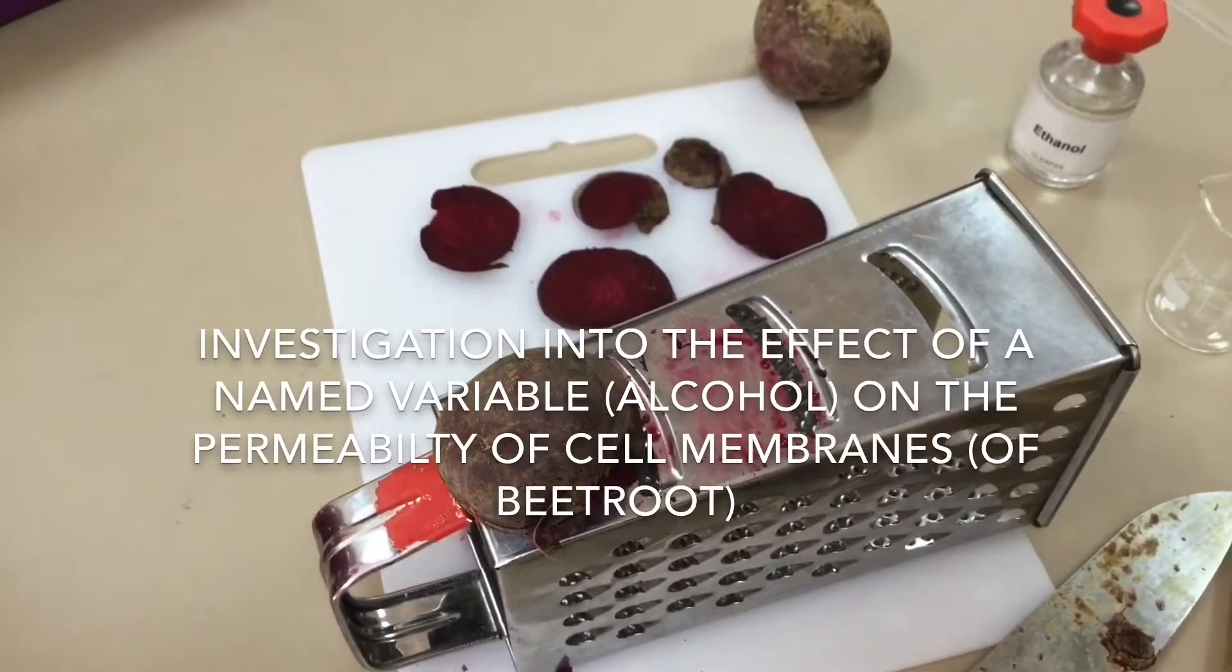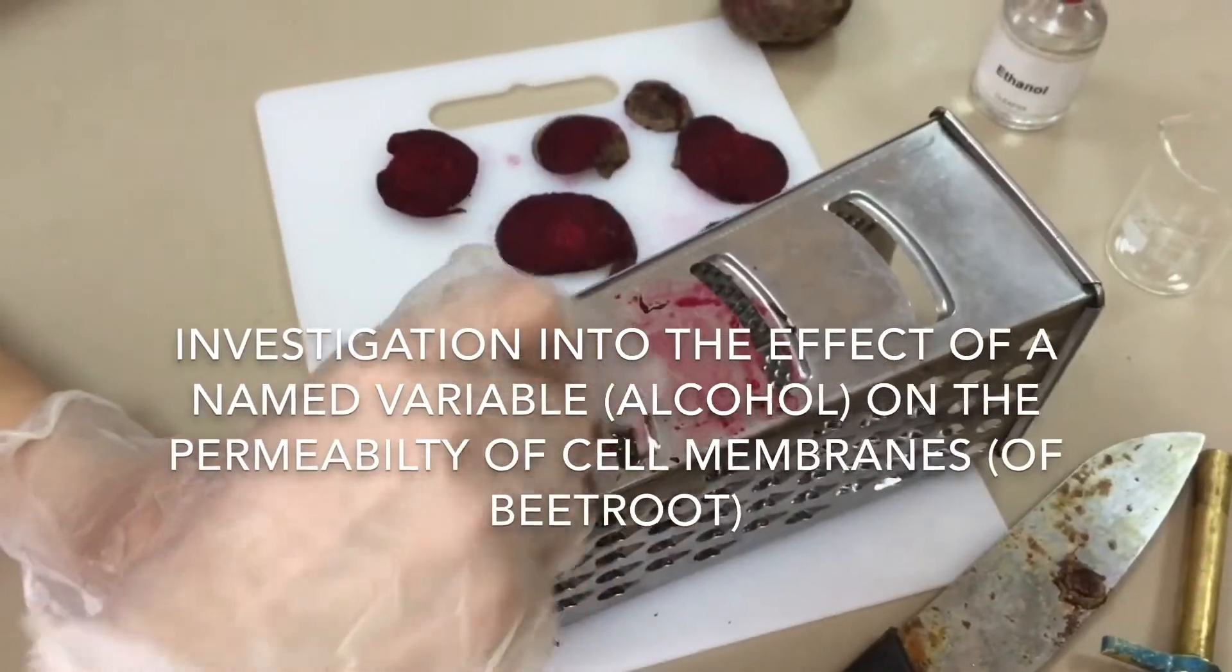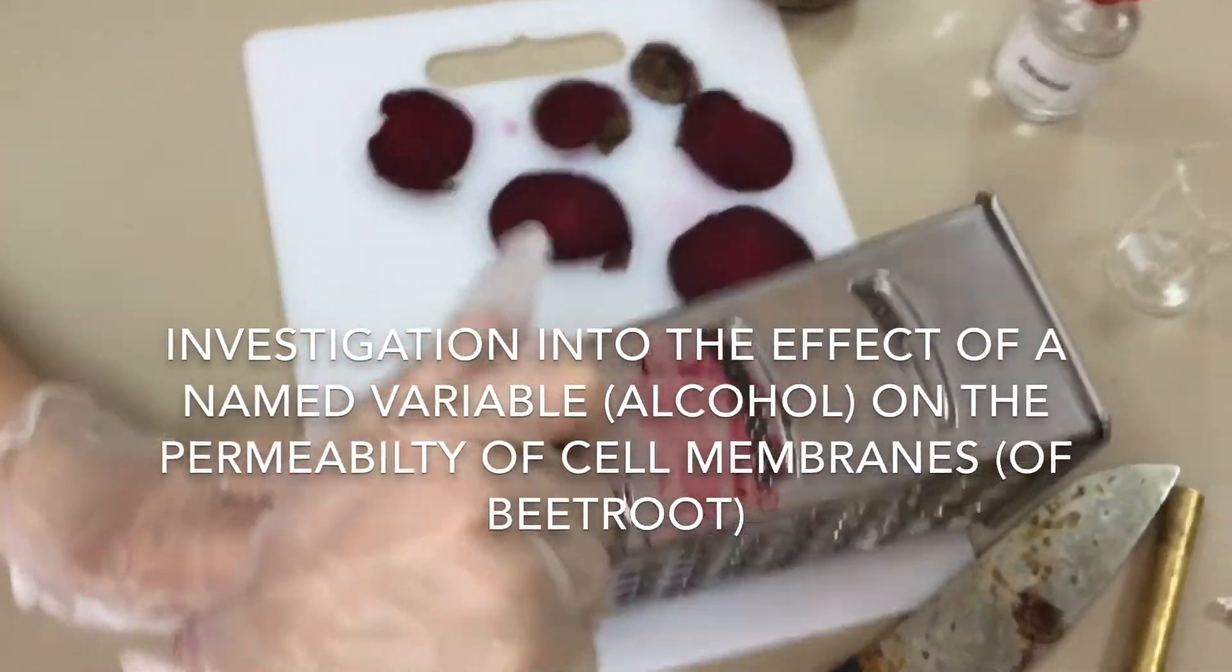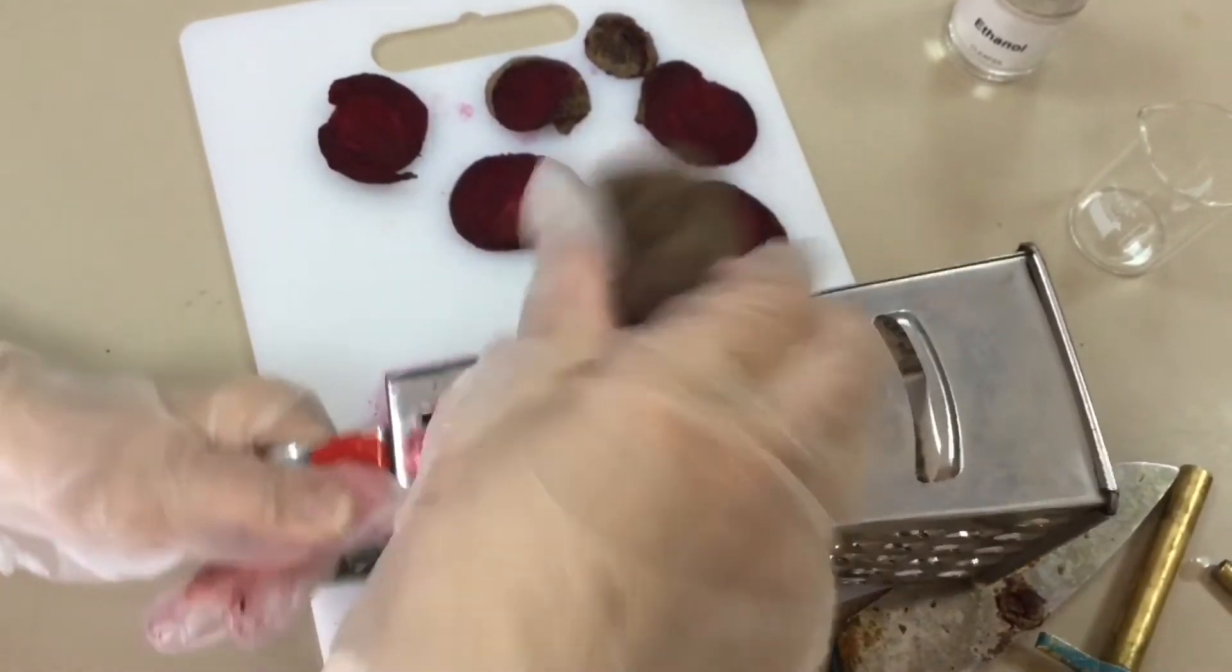The named variable will be the concentration of alcohol, and how we're going to measure the disruption or the permeability is that when the membrane of beetroot cells break down they release their pigment.